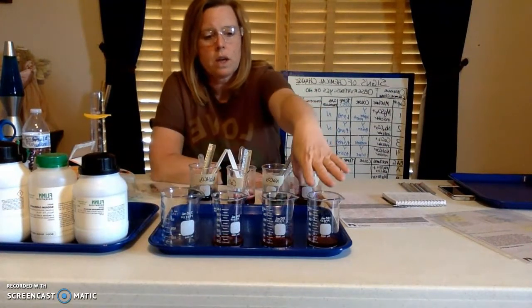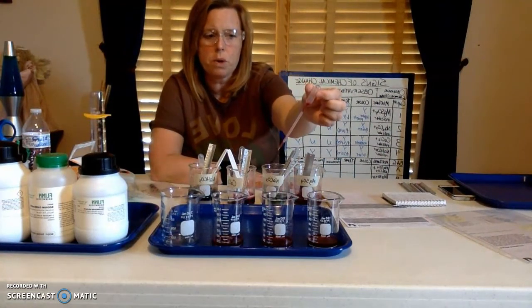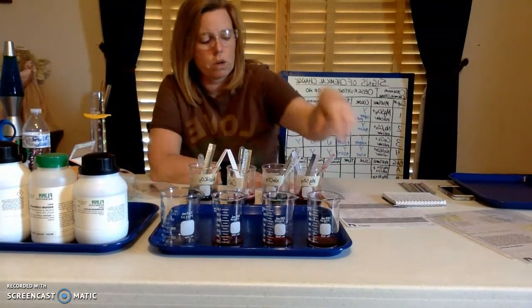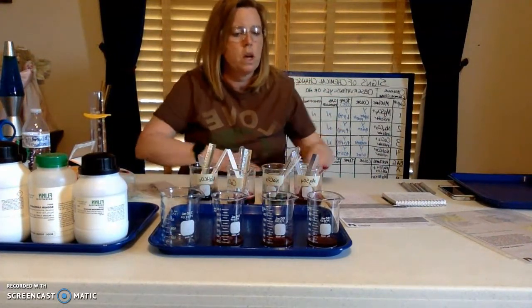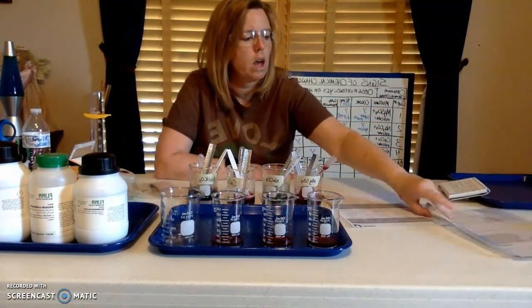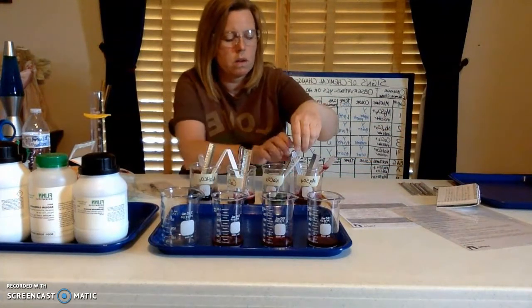So I took the magnesium sulfate and the indicator. I took what is called a pipette versus the glass eyedroppers that we use. And I placed 3 pipettes of the magnesium sulfate into beakers A, B, C, and then D will do something else. So you can watch these things. Baggie A. Let me look at my notes. Sometimes it's hard to remember. We're going to take the sodium carbonate.